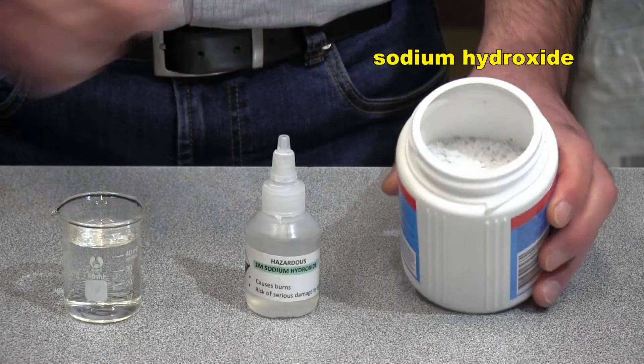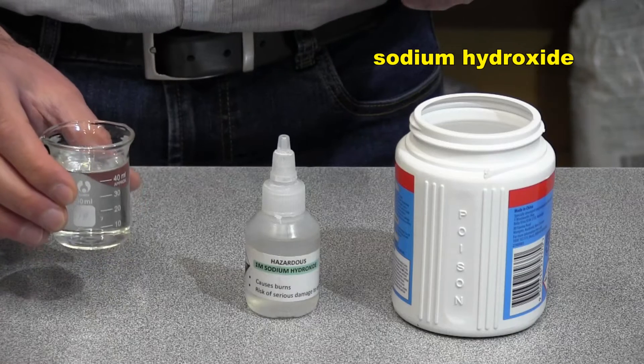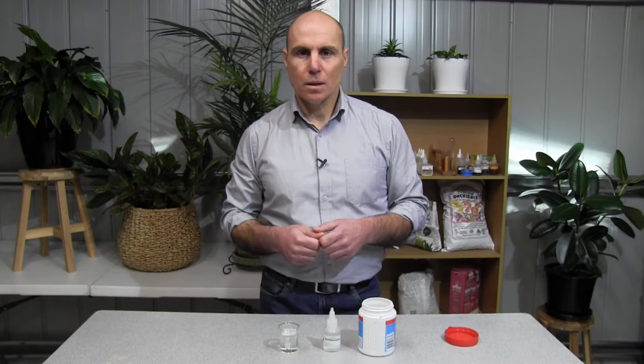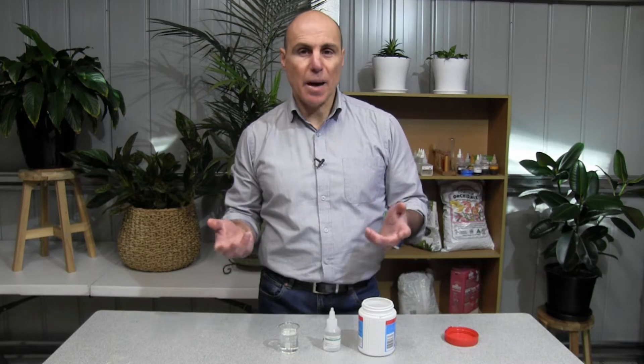This is solid sodium hydroxide, and this is sodium hydroxide dissolved in water. Sodium hydroxide is a base.